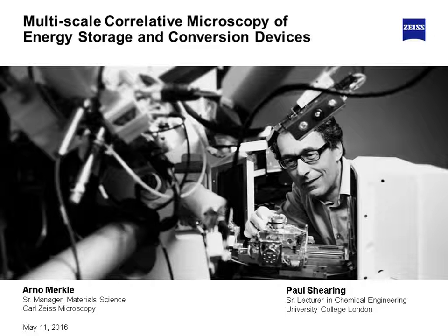Another question has come in, probably for you, Paul, asking what you currently see as the greatest challenge in the multi-scale battery work that you've done. Is it refining the imaging procedures and methods, or is it improving the post-acquisition quantification work? I think it's all of the above, actually. We're really keen and excited to push the spatial resolution down to the finest possible length scale. When I was doing my PhD, I was focused on focused ion beam slice and view, and then we increasingly used X-ray microscopy in recent years, and now I'm coming full circle.